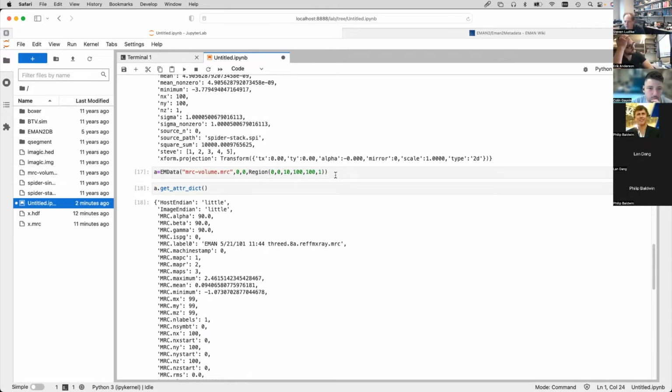Sorry, can you explain again, why are you passing 0, 0 before the region? Because 0 is the image number. This is whether you want to read the header or not. And that's because we don't have named parameters, I can't say region equals, I can't pass a named parameter in because it's not supported by the toolkit that we're using. So you just have to pass something for all of the values. So you have to pass in the correct values, basically. Although I think if you pass None in, it will probably handle that properly.